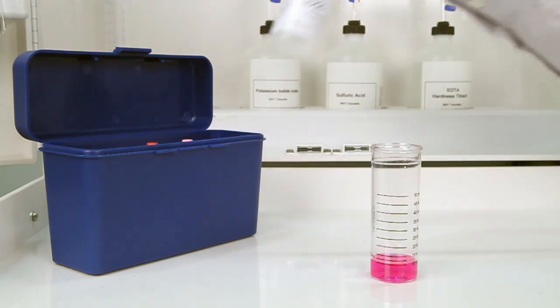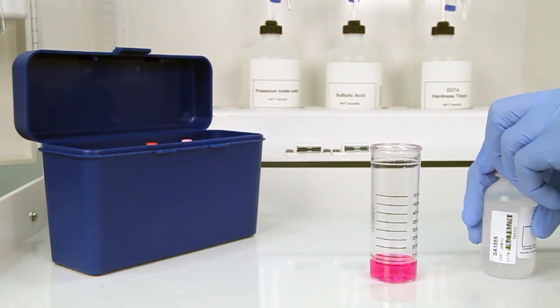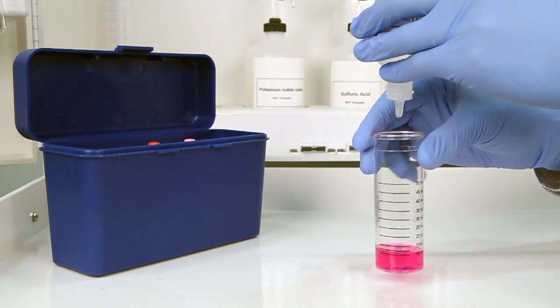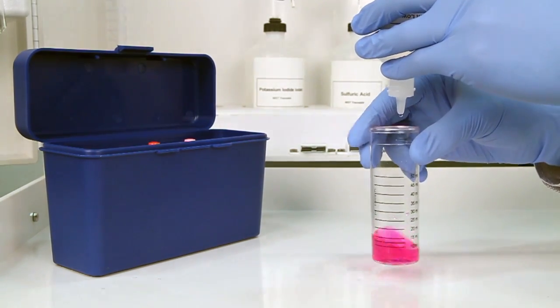The next step is to perform the titration using sulfuric acid 0.5 normal. Each bottle of titrant is labeled with the equivalency and sample size it was manufactured for.